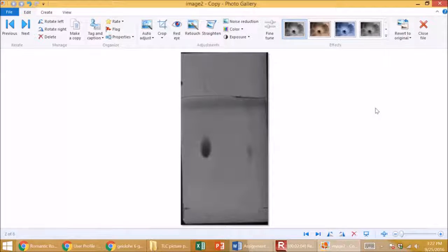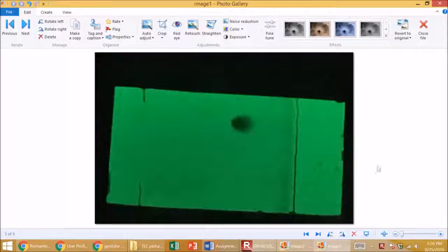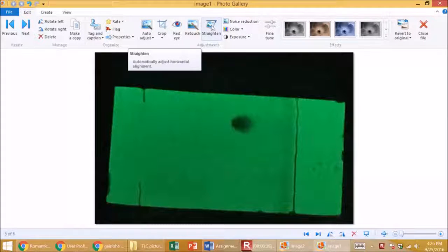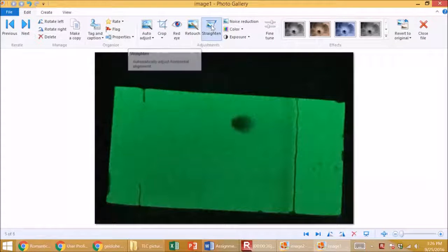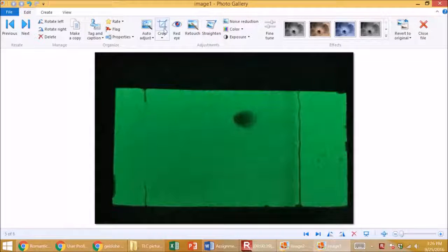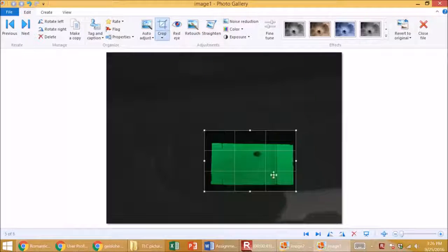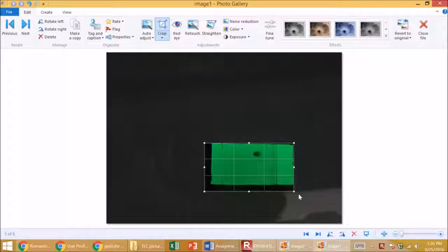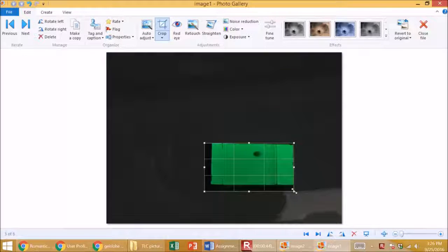Here's another photo. You can see it's crooked, so I also have this control to straighten. And there it is, looks lovely. Then I can crop it and it'll look great.